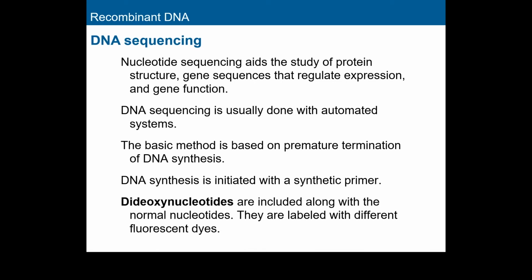All right, so the next thing is DNA sequencing. DNA sequencing is a modification of natural DNA replication. Dr. Sanger, who discovered this technique back in the 1970s, used the mechanism of natural DNA replication and modified it to carry out DNA sequencing.